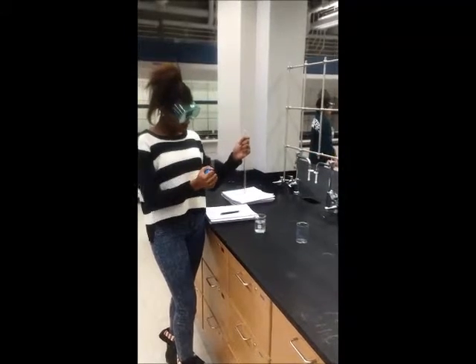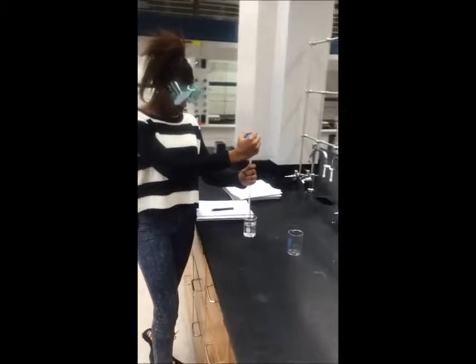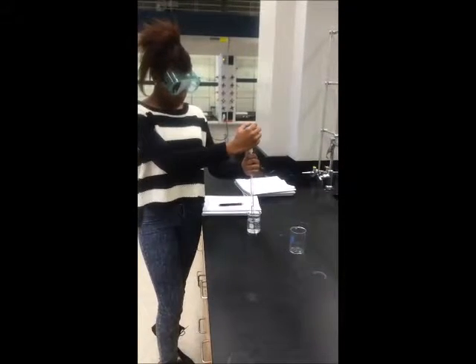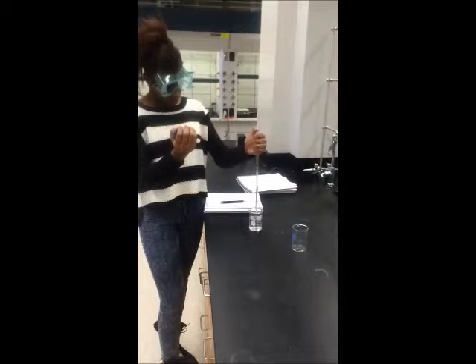To draw water into the pipette, you squeeze the blue suction and place it over the pipette. If you squeeze the blue suction when it's on the pipette, everything inside your beaker will go everywhere. Gently release the blue suction so the water will begin to rise. Place your finger next to the blue suction so when you move it, your thumb can close the hole so all the water won't drop out.